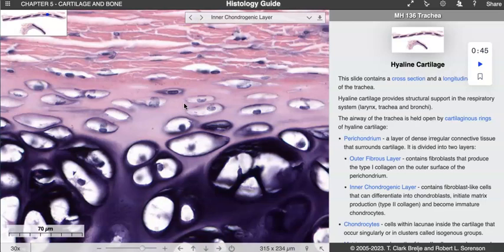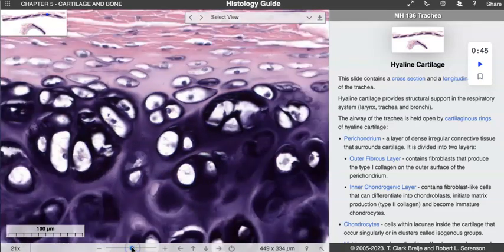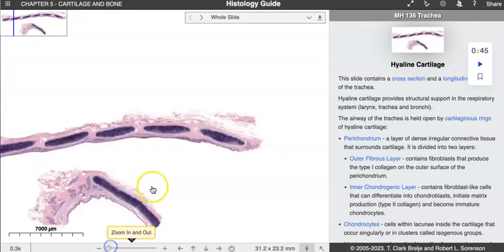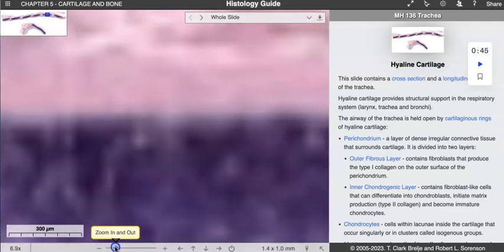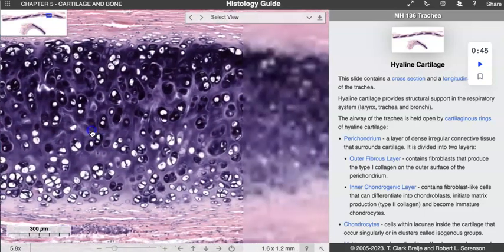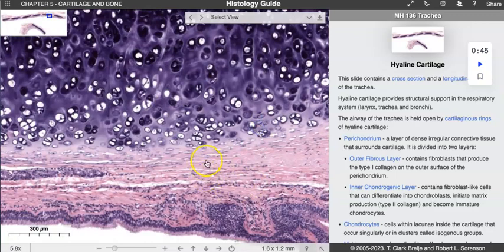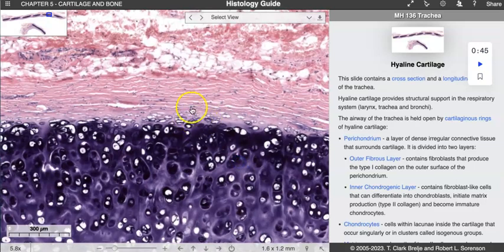We know that cartilage isn't well skilled in repair because, again, we don't have blood vessels traveling through this tissue. So if I zoomed out, you can see, ooh, that's too far. You can see the absence of blood vessels, right? There's no blood vessels in here, none, right? And out here, we have blood vessels out here in the fibrous layer, and also out here. So we can really start to repair some of the collagenous fiber. We can repair fatty tissue.